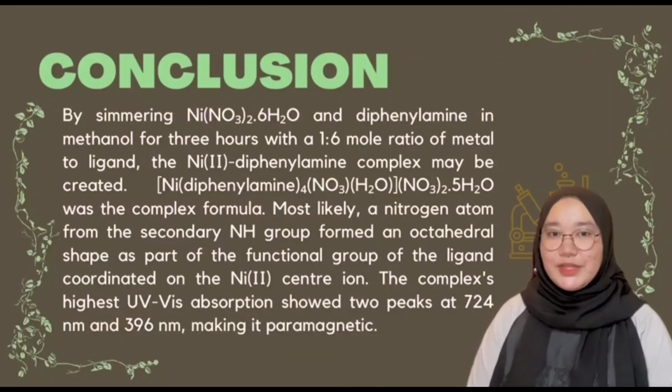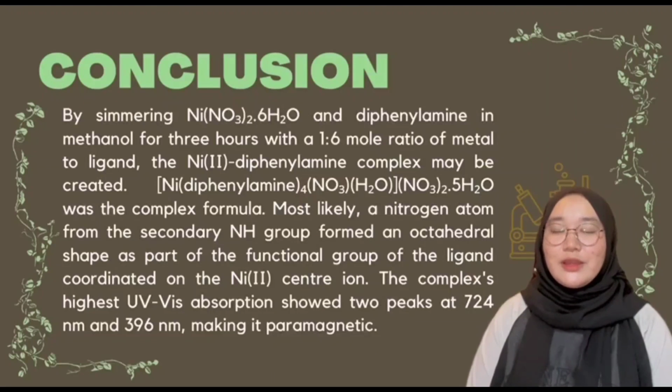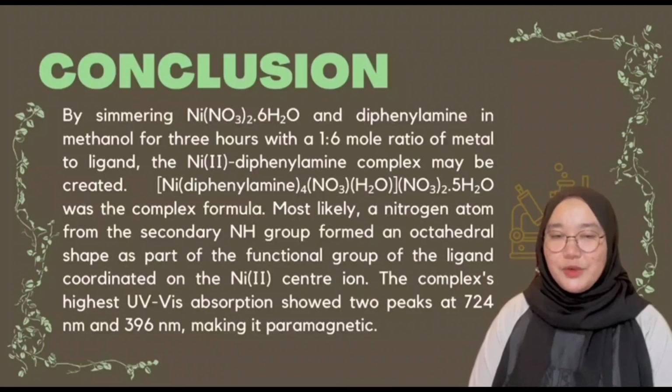By stirring the nickel 2 nitrate hexahydrate and diphenylamine in methanol for 3 hours, the nickel 2 diphenylamine complex may be created. The complex formula has been obtained here, and the geometry structure is octahedral, and the UV maximum wavelengths are at 724 nanometer and 396 nanometer.